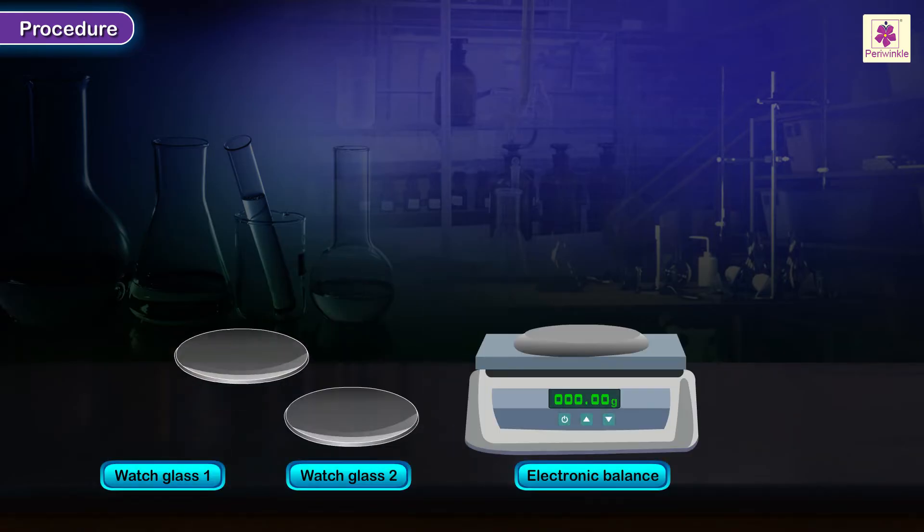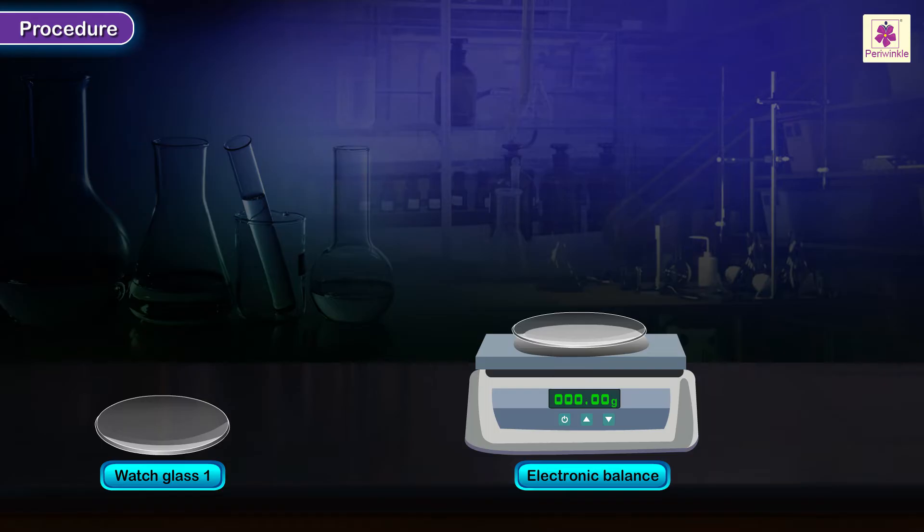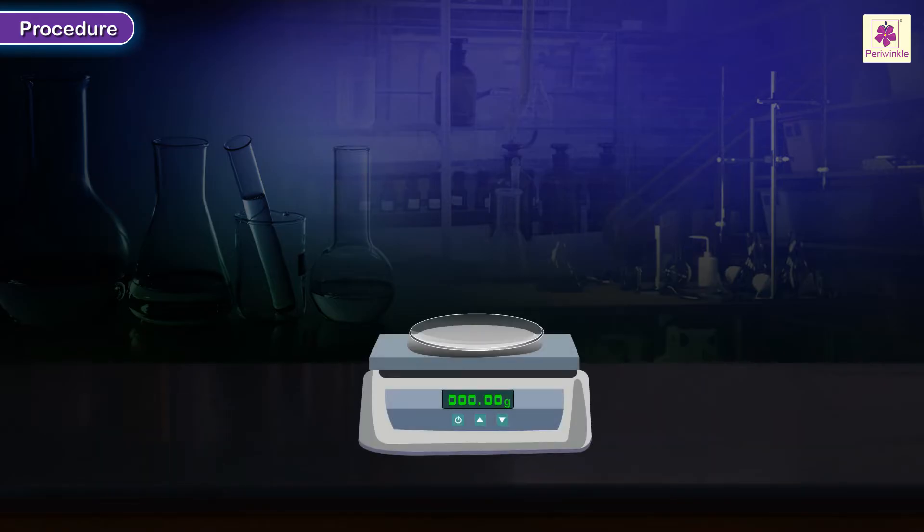Weigh the two watch glasses. Set the reading of the electronic balance to zero. Using an electronic balance, weigh 7.2 grams of barium chloride in one watch glass.